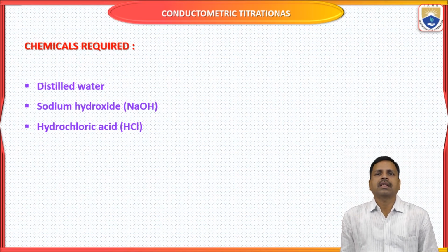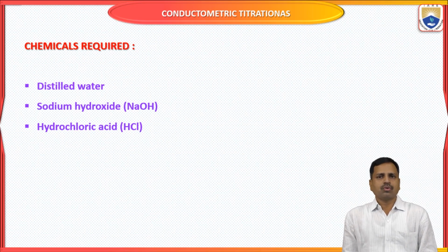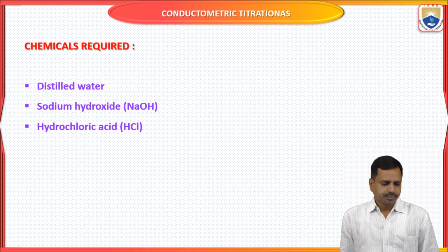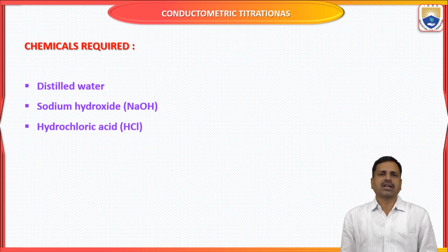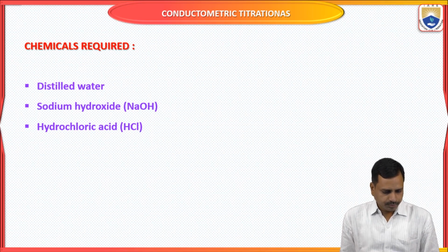The conductivity of any solution is because of the movement of ions, while the conductivity of any solid substance is because of the movement of electrons.